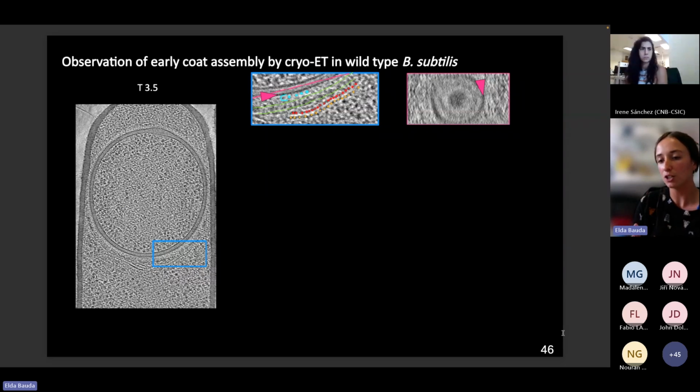And it is possible, if you rotate the tomograms, to look at the surface of those layers instead of their side. For instance, if we rotate the tomograms at the level of the forespore membrane, you will see the forespore membrane from the surface. You have the outer forespore and the inner forespore membrane that forms this black ring in the middle. And in between, you have this thin, darker layer, which is the modified cell wall layer that is known to be in this intermembrane space.